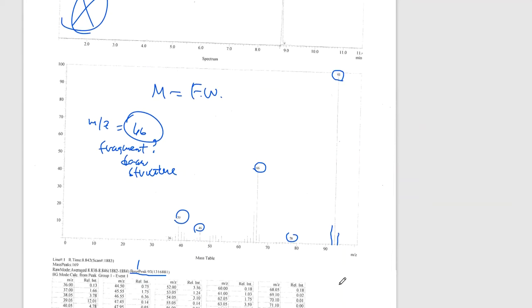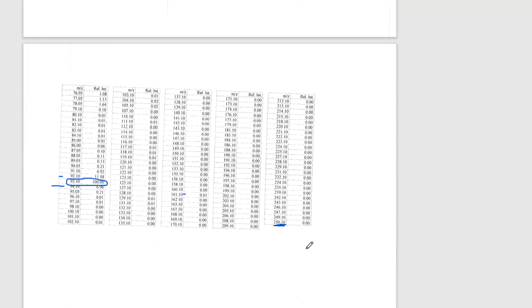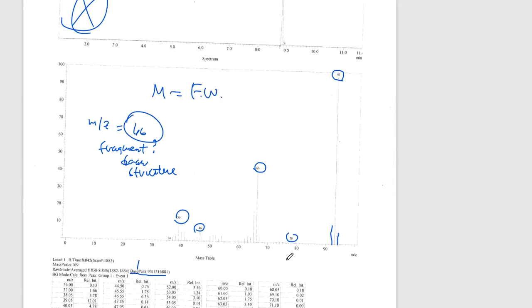So in those lecture videos, you probably have an understanding now of why we see these small little signals that flank the left hand and the right hand side of the major fragment weight. So just keep that in mind. They are there, and that's possibly why you would need to use the fragmentation table to help you determine what a formula weight might be of the compound. All right. Okay, so there you go. There's kind of the information that you would need for this particular lab.